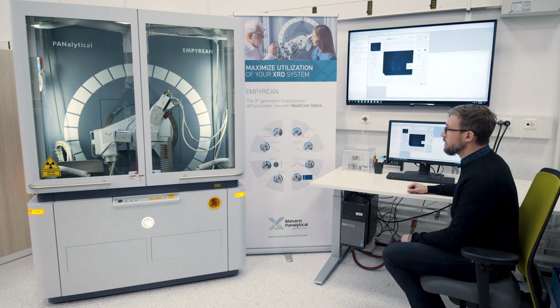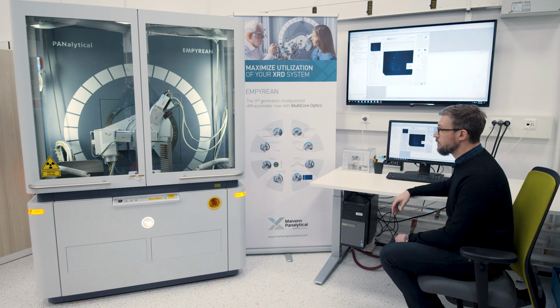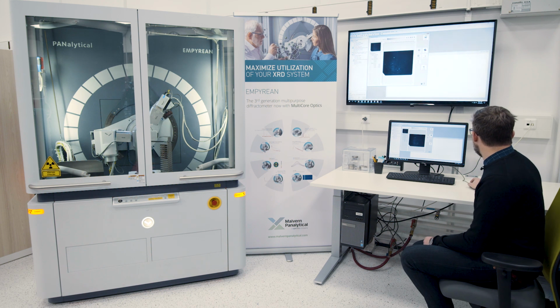Then the setup is completely automatically adjusting itself to the specified measurement conditions that I have defined for all these different types of measurement programs. It will change slit sizes, mask sizes, and it will decide whether it will use parafocusing or parallel beam geometry. And once this is done, the measurement will start and the data will be collected.